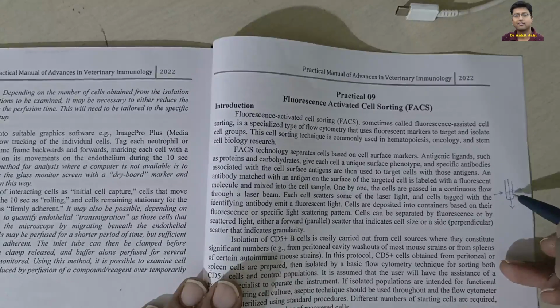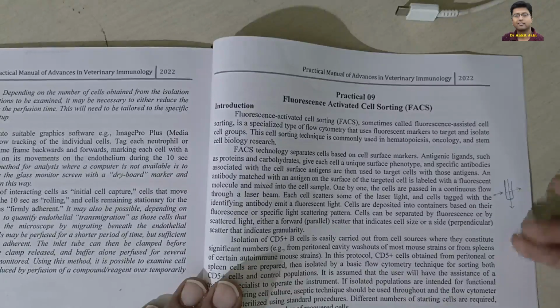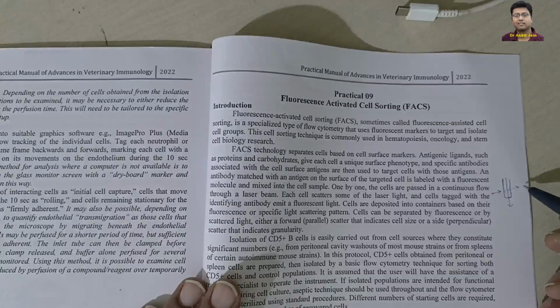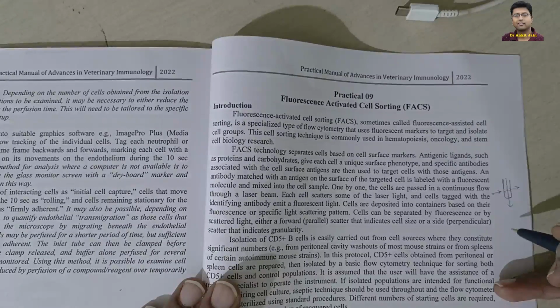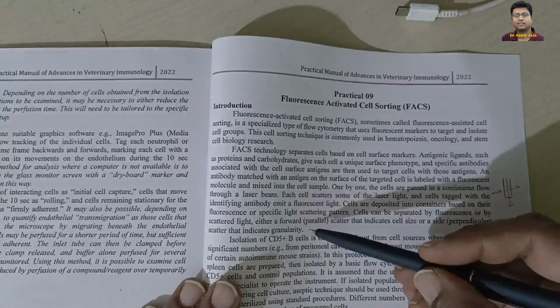So if there is forward or parallel scattering, we measure cell size, and if there is any perpendicular refraction of the light, it is just due to the granularity of the cell.